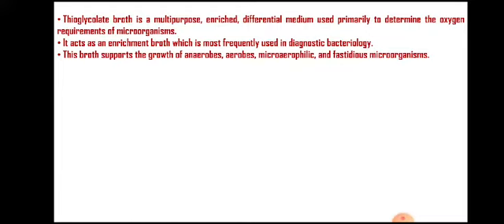But thioglycolate broth is a multi-purpose enriched differential medium which is used to determine the oxygen requirements of microorganisms. This means that thioglycolate broth supports the growth of all types of microbes which have differences in their oxygen requirement.